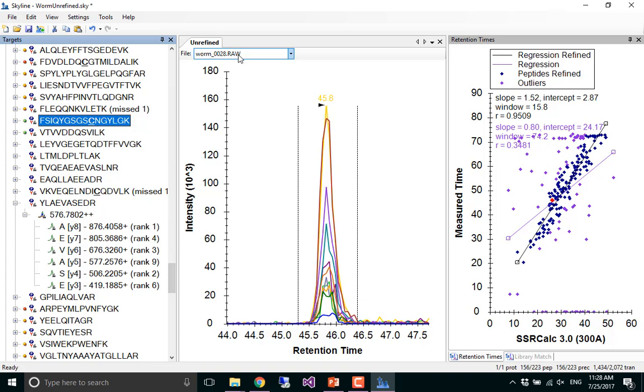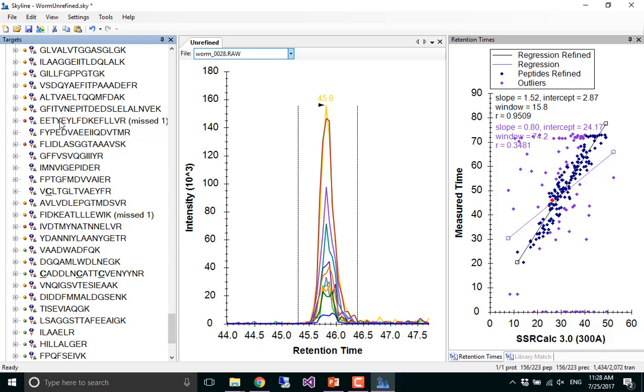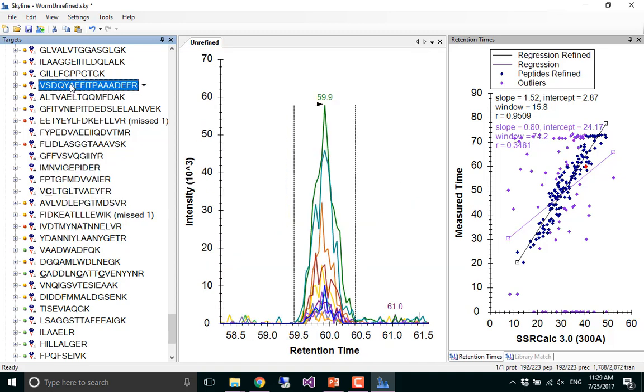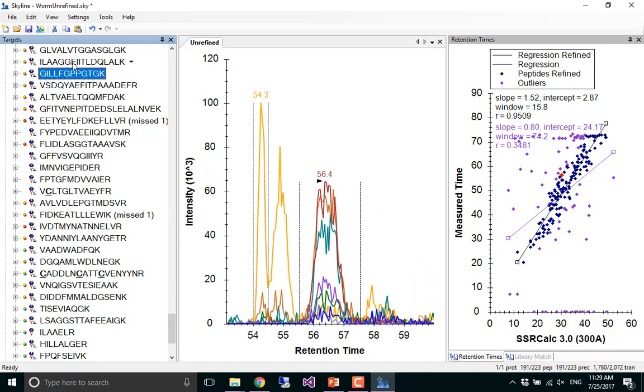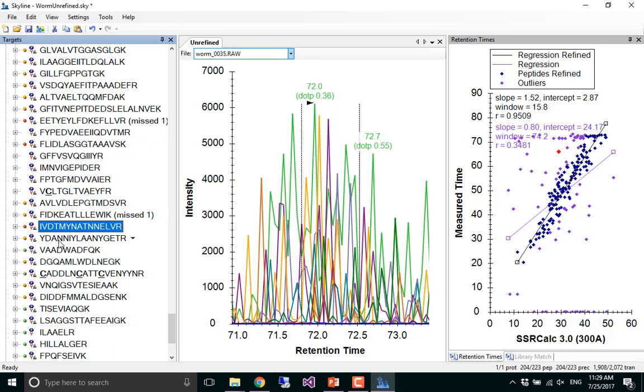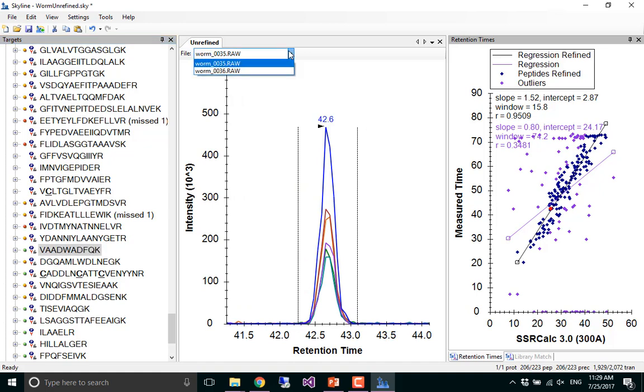She named one method 27, one method 28, and then she skipped this one. There are actually two of these blank spots now. This one too. And in this case, it's really the spot afterwards where 35 and 36 got measured twice, and the true 35 never got measured.